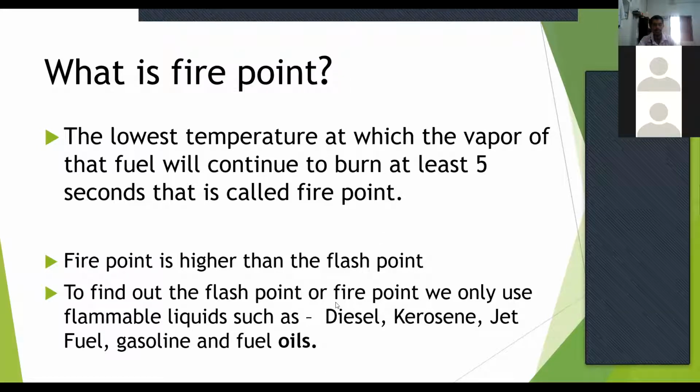So there are a lot of examples: diesel, kerosene, jet fuel, gasoline, and fuel oils, right? Other than this, there are also a lot of petroleum products that can catch flame, right? If we have a sample of those things, we can find out the flash point using this apparatus, right? So these are the things about fire point and flash point.